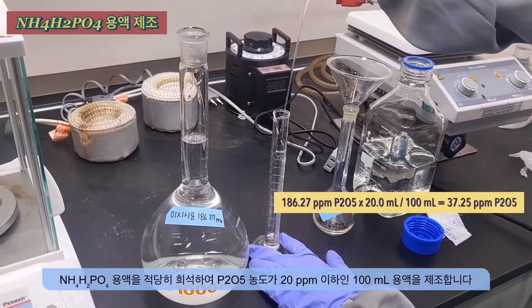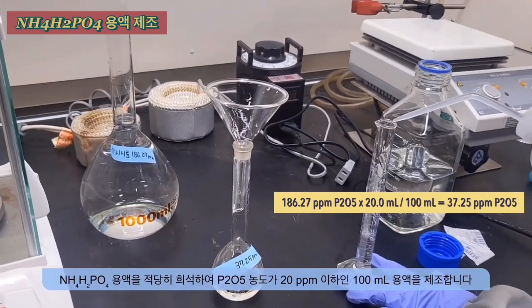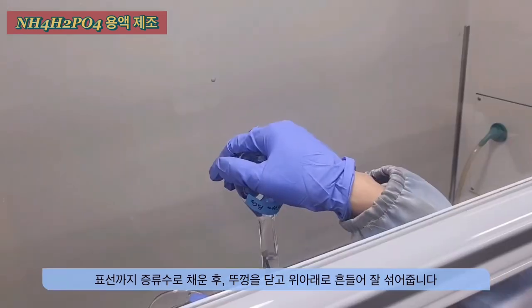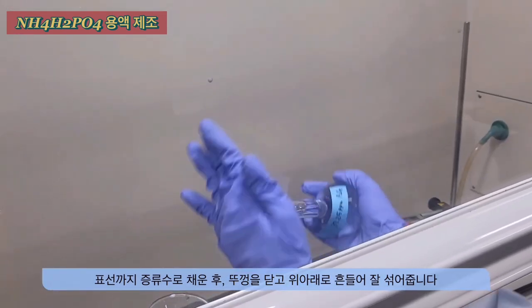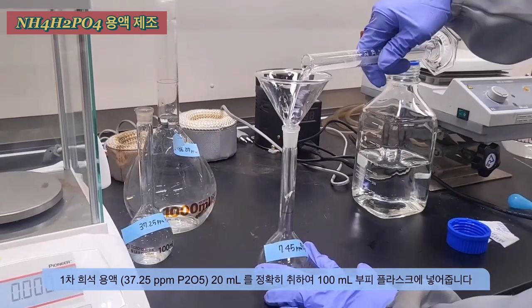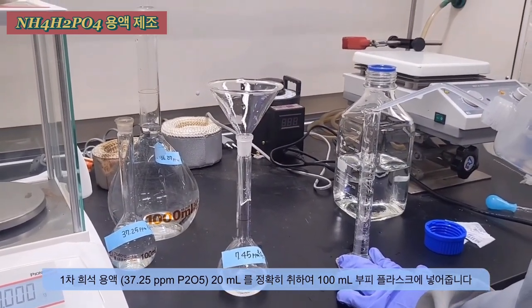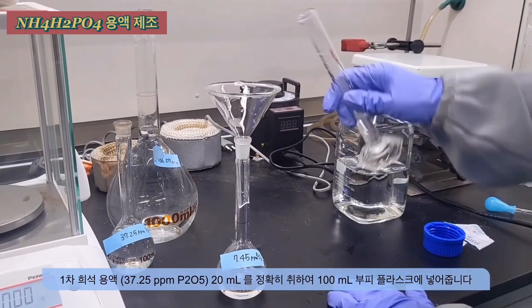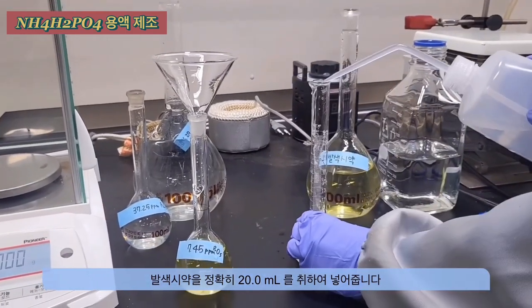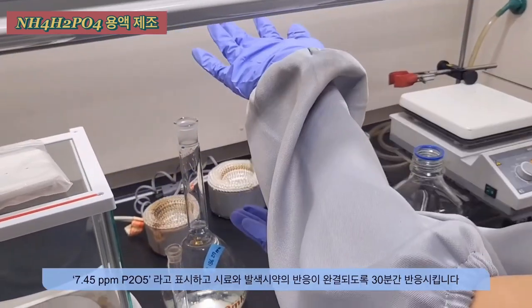Here is the process for diluting the ammonium dehydrogen phosphate solution. Take 20 ml of the 186.27 ppm solution and distilled water. Take 20 ml of the first dilution solution and transfer it into a flask. Take exactly 20 ml of the coloring reagent, add it to the flask, mix the solution, and wait for 30 minutes to allow the reaction to complete.